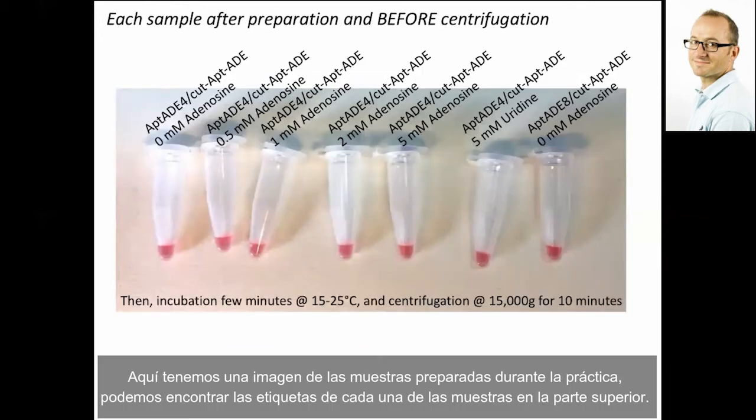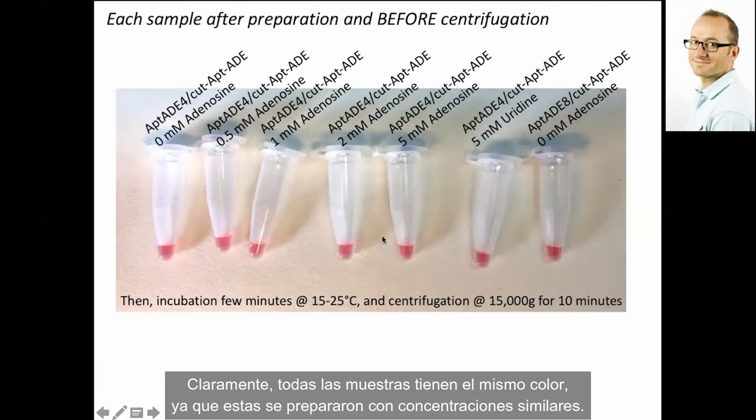Here are the samples you prepared. You can find here the legend for all of them. You can see that they all have the same color because you prepared these samples with similar concentrations.